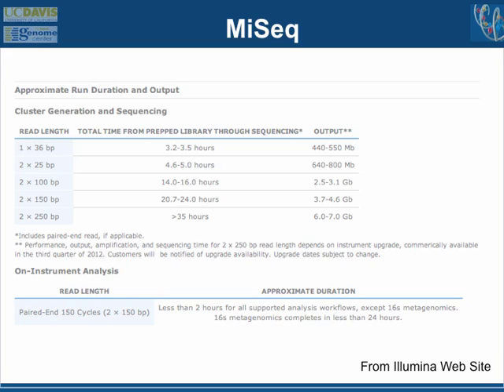So again, the key that everybody has to deal with now, if you're not sequencing, say, entire genomes to do comparisons of entire genomes, is figuring out how to pool together samples, tag them in some way and mix them together into a single run of one of these machines. Because you don't need, however many sequences this is actually generating for 6 gigabases, 100 million sequences or whatever it is, you don't need that to do population genetics of a mouse. You don't need 100 million sequences from each mouse or each plant sample.